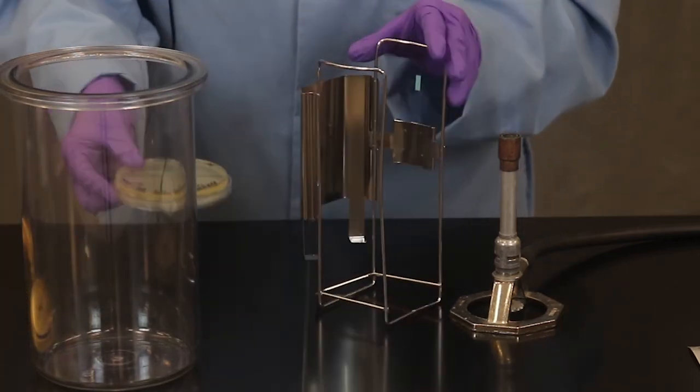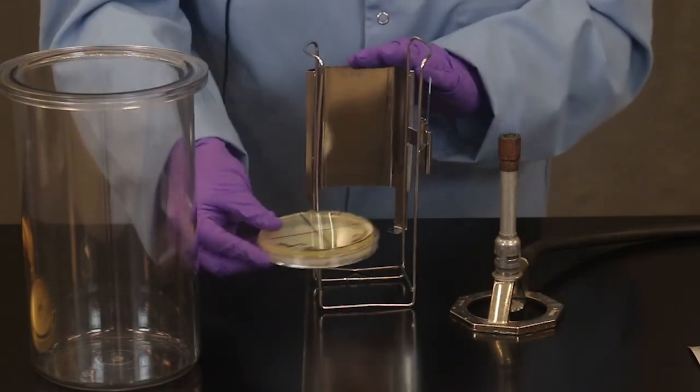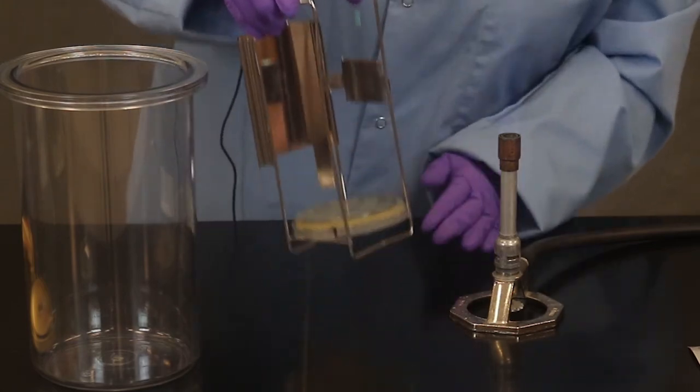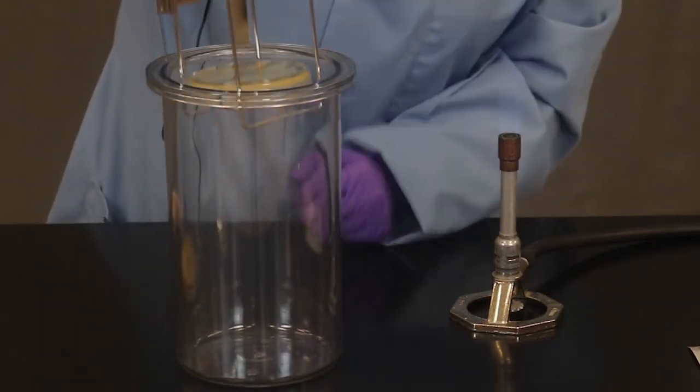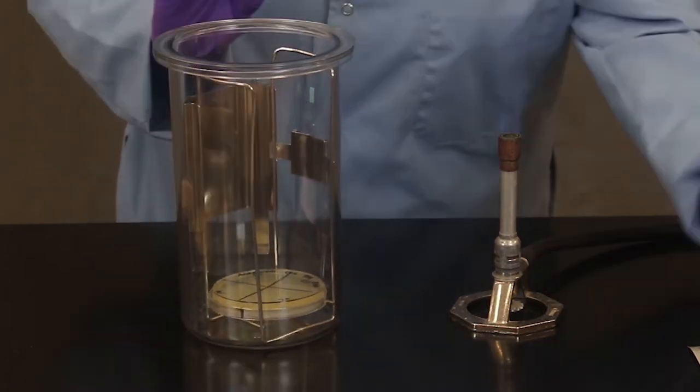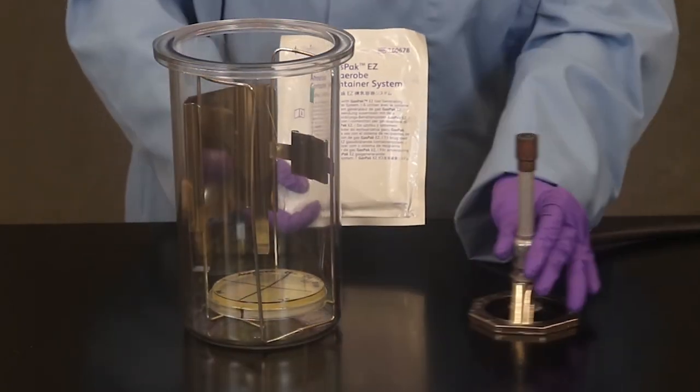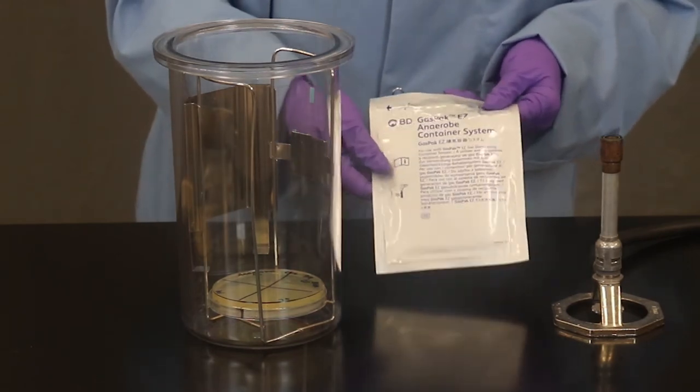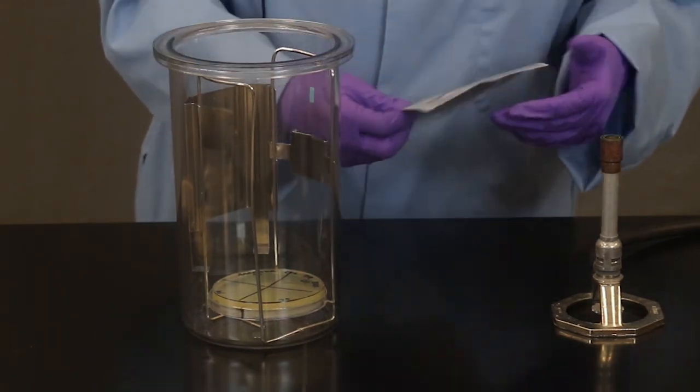So you're going to take your anaerobic plate. Our lid is on the bottom here. You're going to feed it into the metal rack. Place it into the jar. And before we can close this up we're going to add our gas pack here. And this is going to help chemically chew up the oxygen in the jar creating our anaerobic environment.